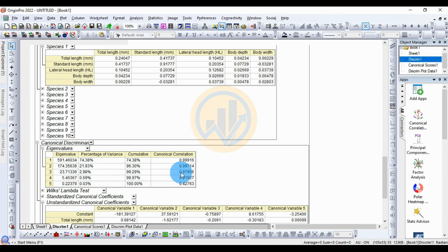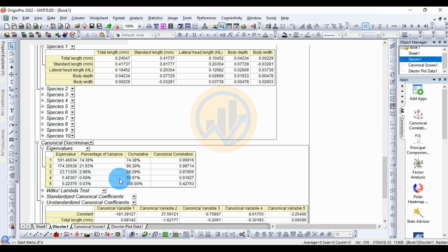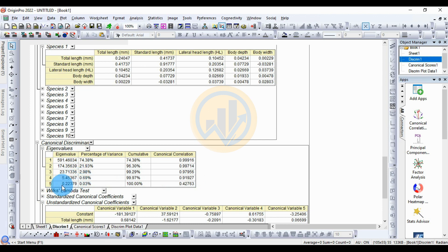For canonical variable 4, the eigenvalue is 5.45367, percentage of variation is 0.69%, cumulative is 99.97%, and canonical correlation is 0.91927. For canonical variable 5 — the last — eigenvalue is 0.22379, percentage of variation is the lowest at 0.03%, cumulative is 100%, and canonical correlation is 0.42763.